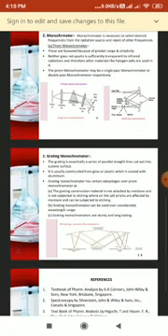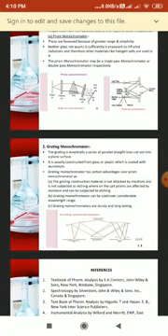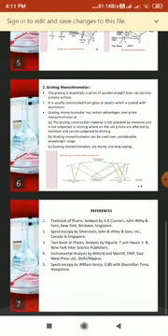Now we have seen the second type of monochromator, the grating monochromator. The grating is essentially a series of parallel straight lines cut into a plane surface. It is usually constructed from glass or plastic which is coated with aluminum to minimize greater amounts of scattered radiations and the unwanted radiations of other spectral orders. The gratings are blazed to concentrate the radiations into a single order.